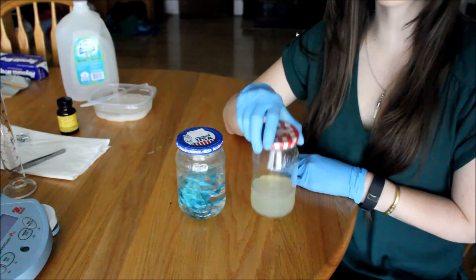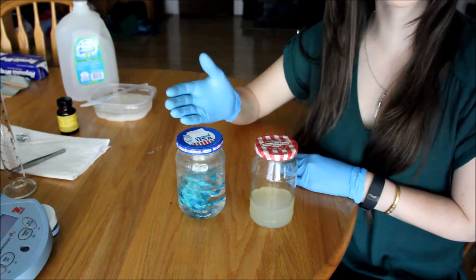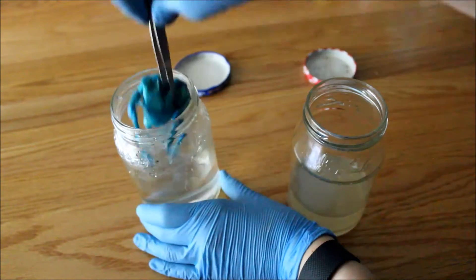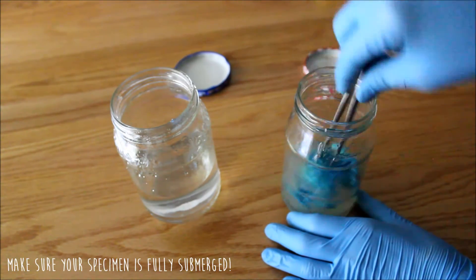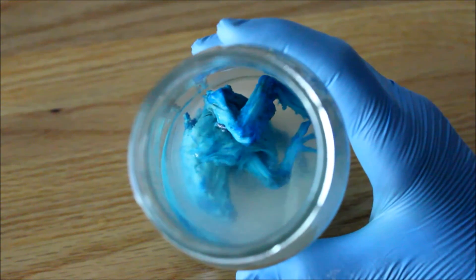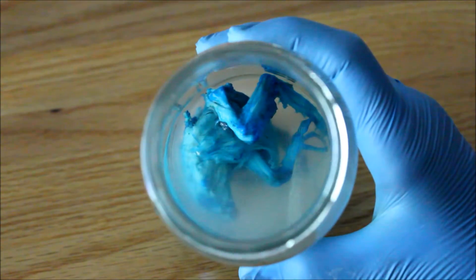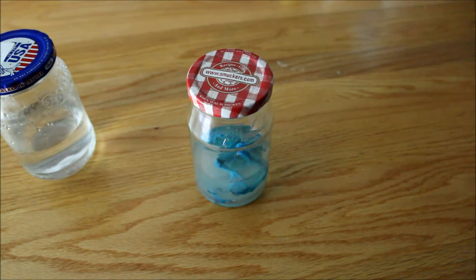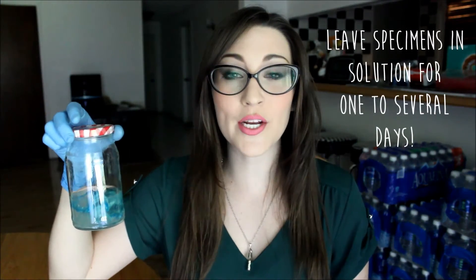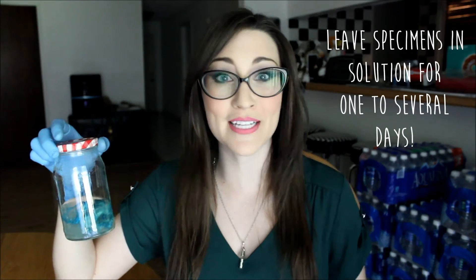Now that I have my trypsin digestion solution complete, I'm going to be transferring my specimen, the bird, from the distilled water from the rehydration step into the trypsin solution. Here's my bird in the trypsin digestion. I'm going to be leaving it in the trypsin digestion for anywhere from one to several days — it really just depends on my specimen and how it looks, because I'm looking for a limp specimen and for the muscles to become transparent so I can view the skeleton inside.